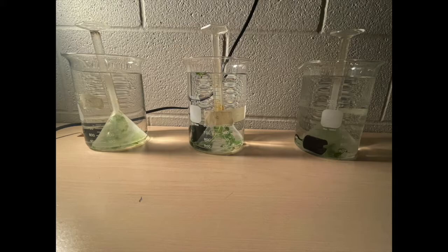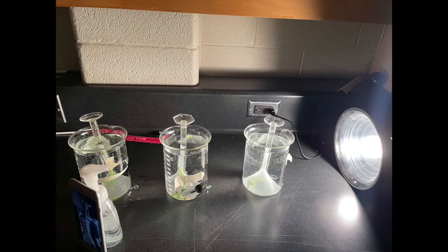We turned on the lamp, ensuring that no external light source was present, and recorded quantitative and qualitative observations before and after 3 hours. The objective was to measure how much water was displaced, which would later indicate how much oxygen was produced in the graduated cylinder placed on top of the funnel.